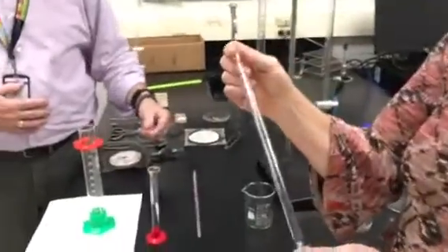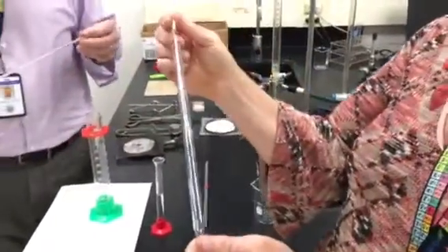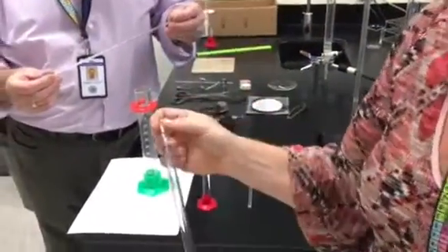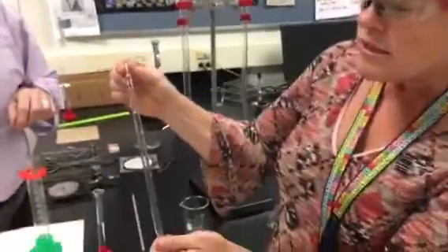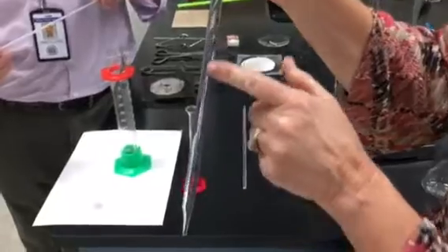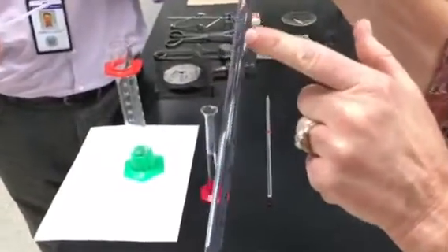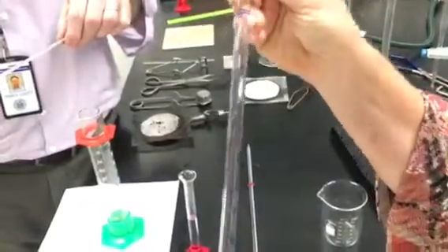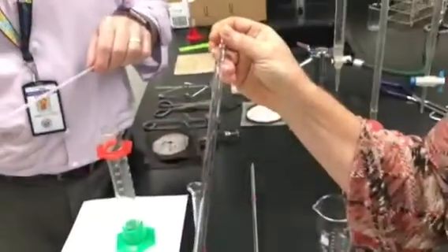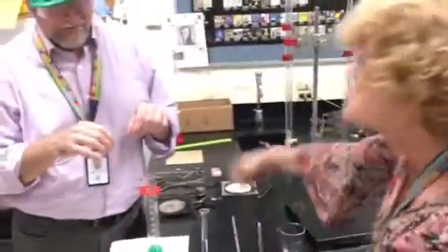Now, you probably won't use this year in chemistry. It's used more often in AP. However, we expect you to know how to use the scale. So if you look at this once again, what does it go up by? Okay, the smallest tick marks is tenths, correct? Tenths. So therefore, you can measure out to what, guys? Hundredths. Wow. Okay, now do the other pipette.